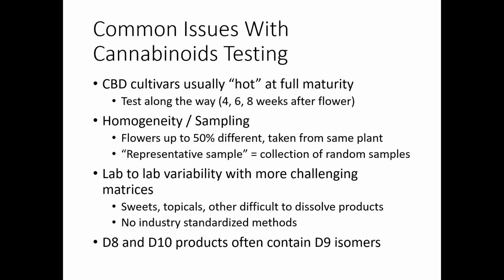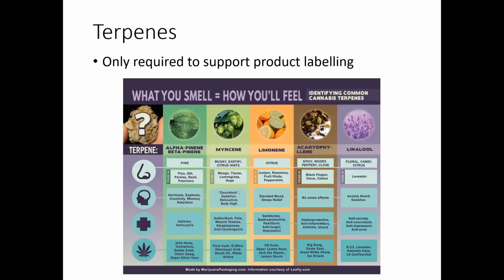And I don't necessarily want to go that route either, but I just want you to be aware that when you're forming these Delta 8, Delta 10 products, you do get a lot of side products and isomers and things that complicate the analysis. And you may see things that you didn't expect to see. I've heard in a lot of cases Delta 10 showing up as CBC instead of Delta 10. And in my hands, they're very close together when they come out of our instruments. So just some issues that we're living with right now and on the lab side working to face, but that you should be aware of possibly.